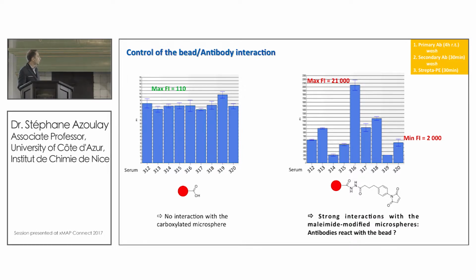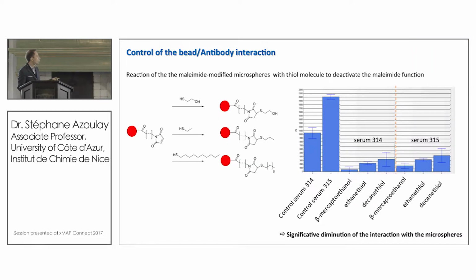So what we did, we tried to block the maleimide microsphere with a thiol molecule to deactivate the maleimide function, and then we realized that all our interaction was far diminished. So that means that we don't have any more coupling between our antibody and the microsphere.